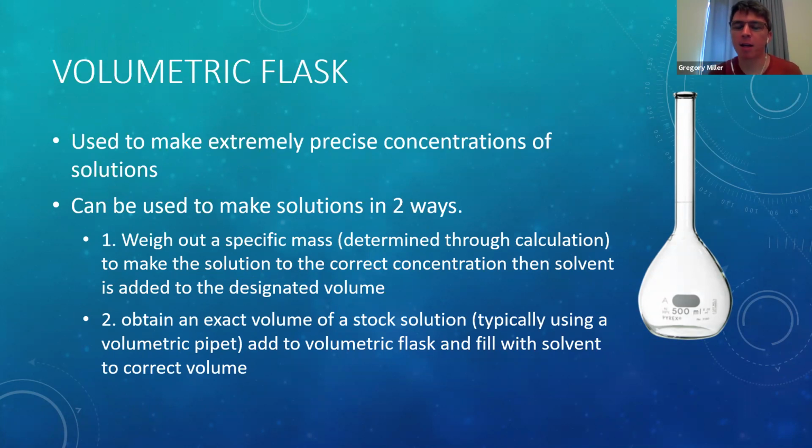And the specific gravity experiment we're doing today is kind of the culmination of one of those first units. We've looked at how to take measurements, both mass and volume, and how to find density. We're going to use density and specific gravity and concentration and calibration curves to put all these pieces together in ways that will make more sense as we go through.